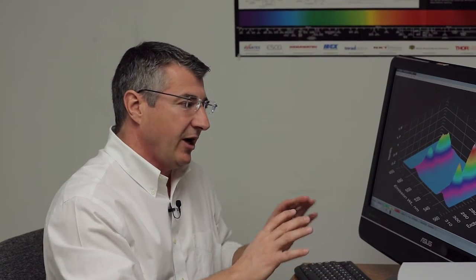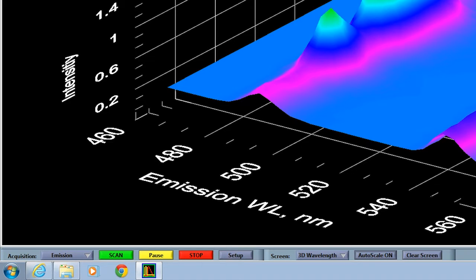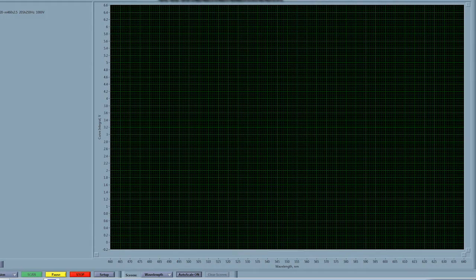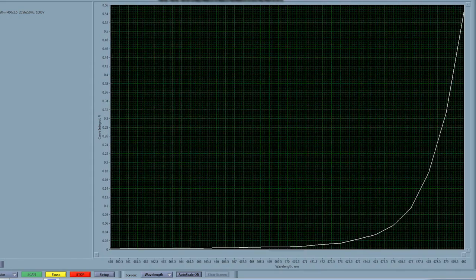Now there are a lot of things that can be done with the software. There's many options and a lot of things that can be adjusted and parameters that can be tweaked. However, I just wanted to demonstrate first just how easy it is to use the instrument. And so with this particular instrument we have a setup that's been prepared and we can just simply hit scan and it's going to do an emission spectrum of terbium.